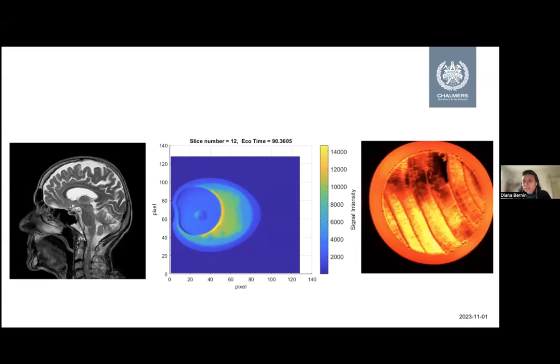This is maybe more familiar to you. That's an MRI image of a piece of wood. The wood is immersed in water, and it's in a cup. So here outside this red ring, it's water, but then you have here the wood, which has been soaked in water for a while. And already here you can see different features. You can see here these different rings. And you have like, here is something red, and here it's something more dark.